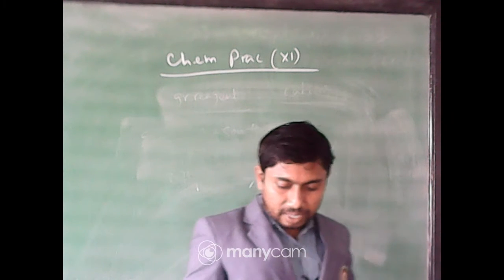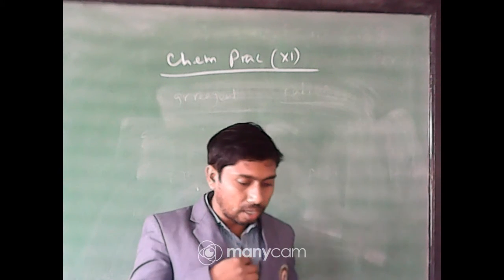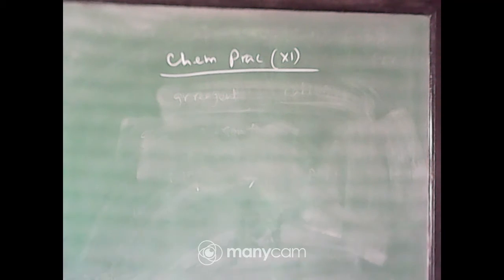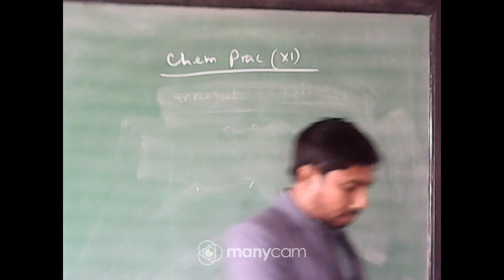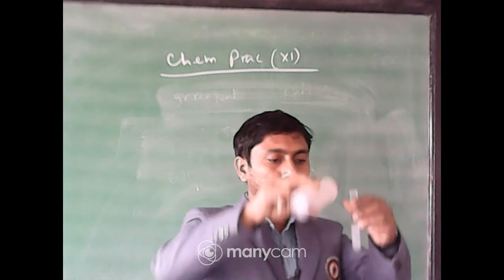Now we will add here blue litmus solution. Okay. This is blue litmus, just 2 to 3 drops.